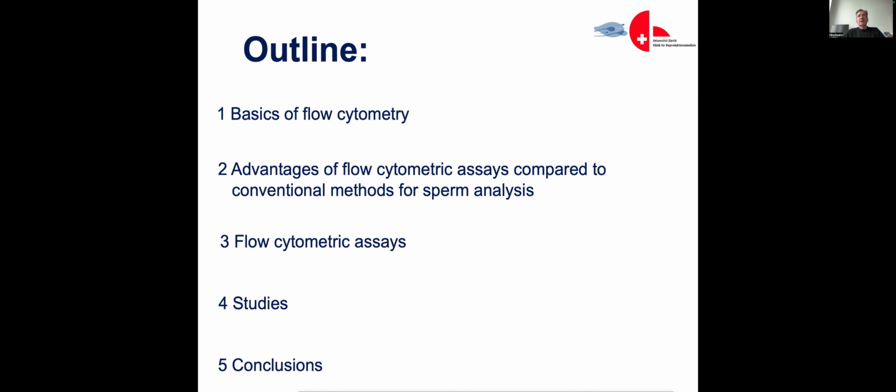In my presentation, I would like to give you at first some information about the basics of flow cytometry, because I think there are also veterinarians or first-year students for whom this technology may be new.